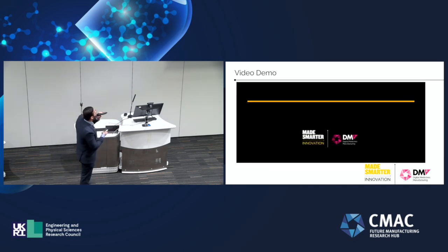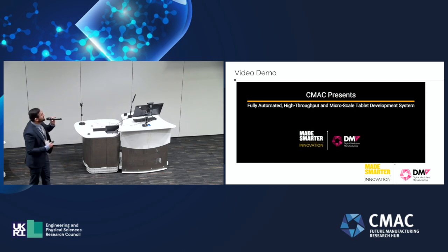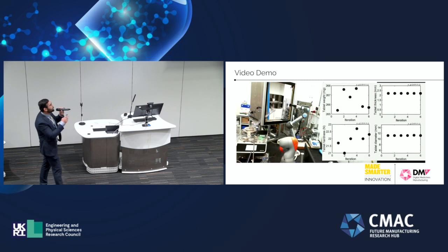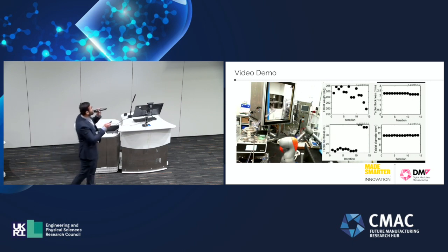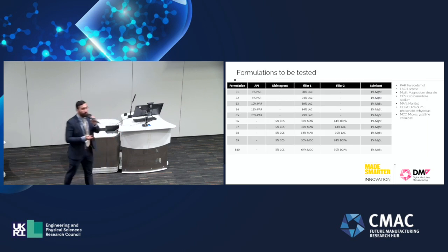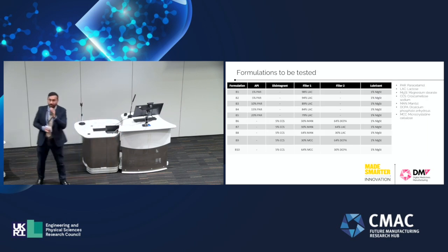So this is a very short video. Obviously, it does not show the whole process, but a glimpse of the whole process in which the robotic arm moves from platform to platform to capture high quality data. Feel free to join me for a live demonstration around 11 o'clock.